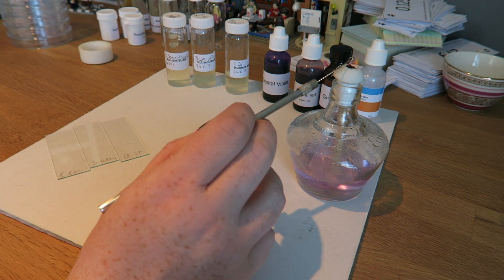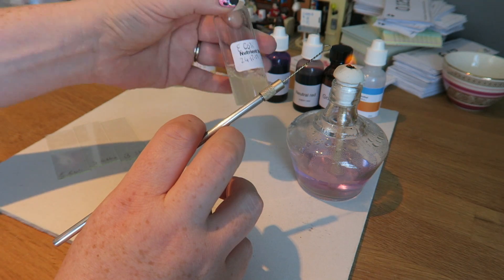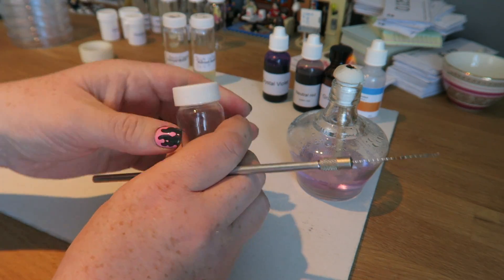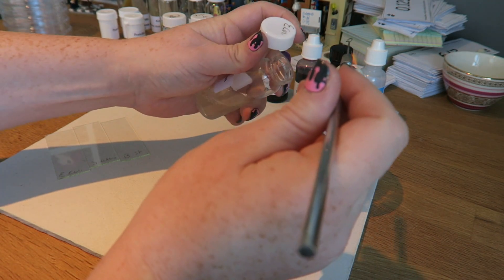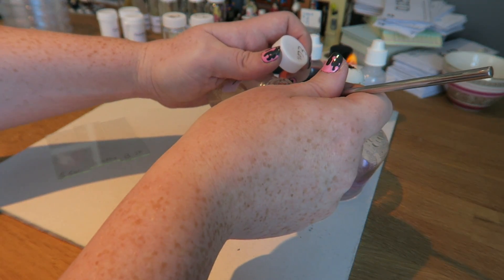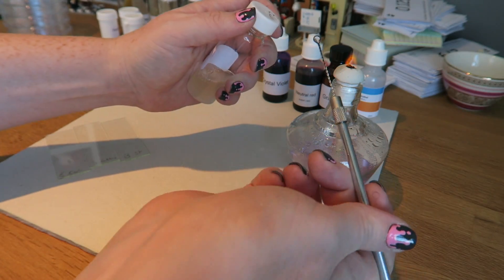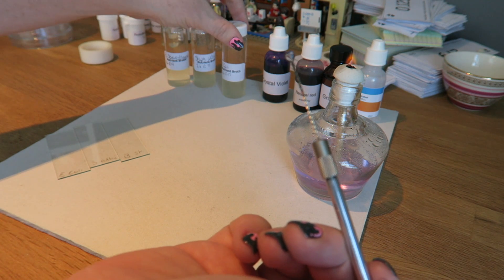I'm going to take my inoculating loop and heat it up so it's sterile. Take my bacterial culture in suspension, wait until my loop has cooled down. Opening it up near the flame, I'm going to take a loop full. So there is now a loop full of liquid bacteria inside my loop.